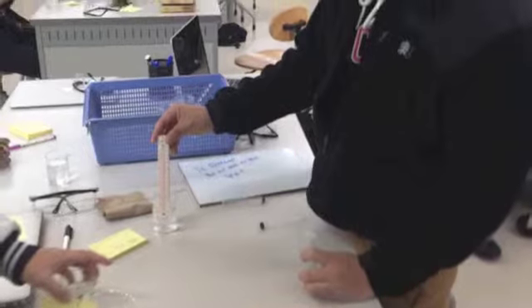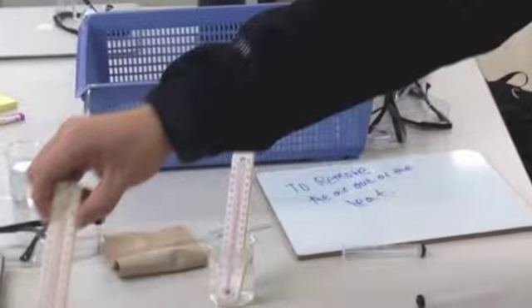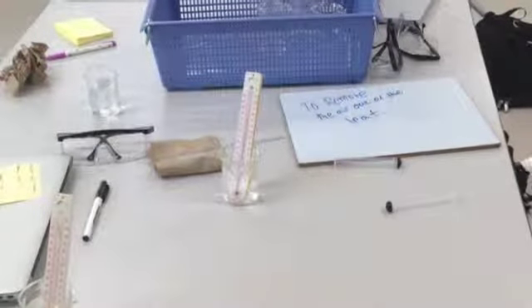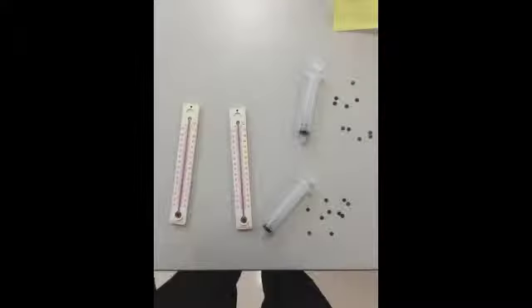We measured the temperature of each beaker. The temperature of the heated beaker was 62.7 degrees Celsius. The beaker at room temperature was at 26 degrees Celsius. Our team cut a total of 20 uniform leaf discs, and we put 10 in each cup.